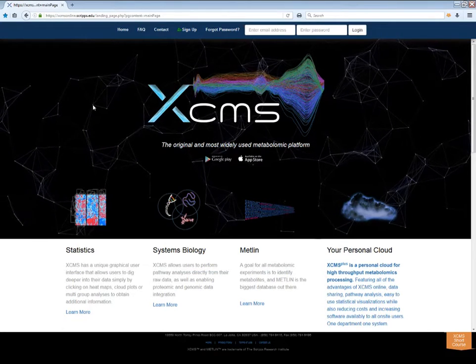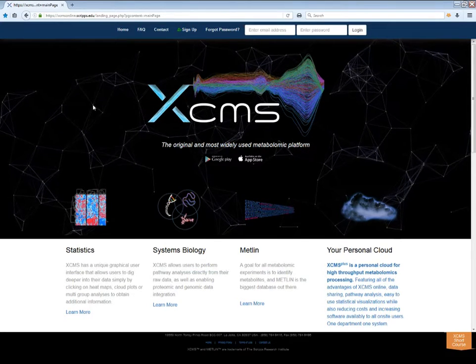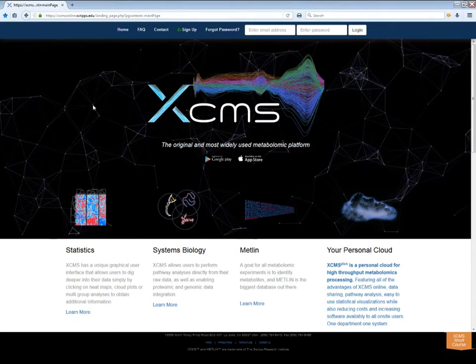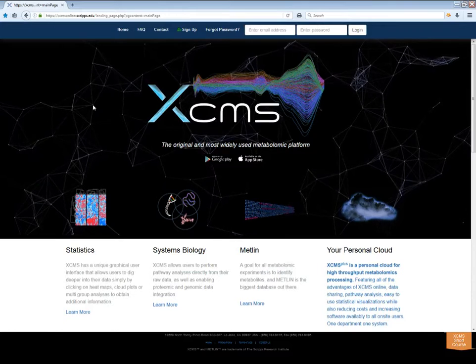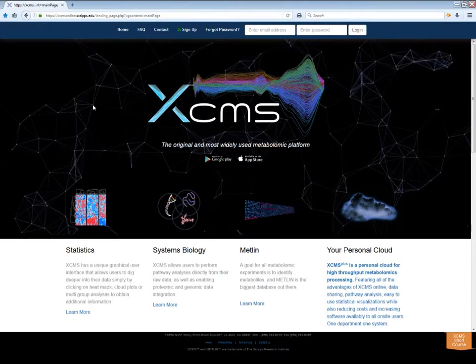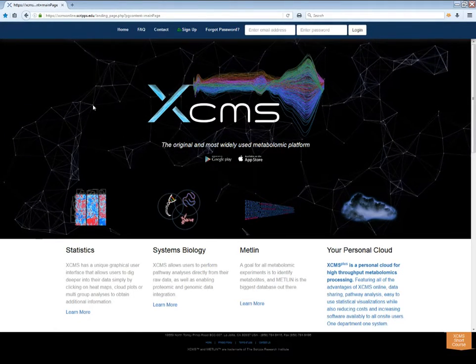Hello and welcome to a quick overview of the XCMS online software. This video will show you how to get started running experiments with XCMS.